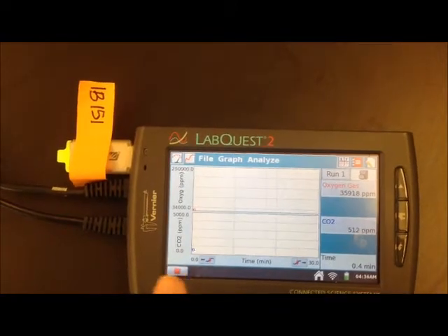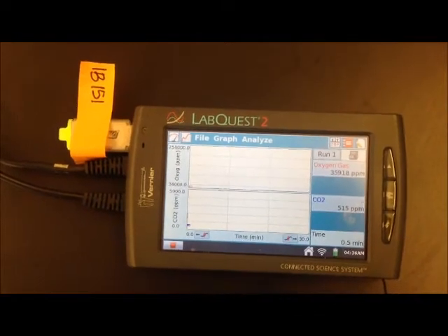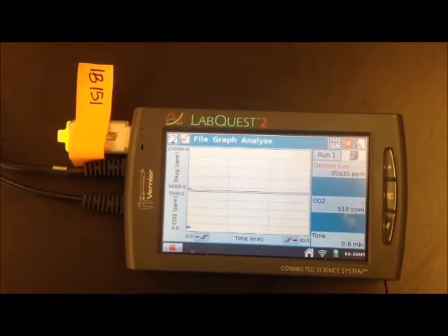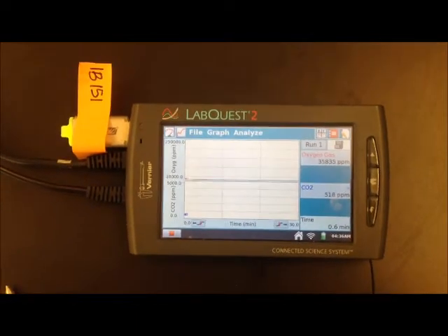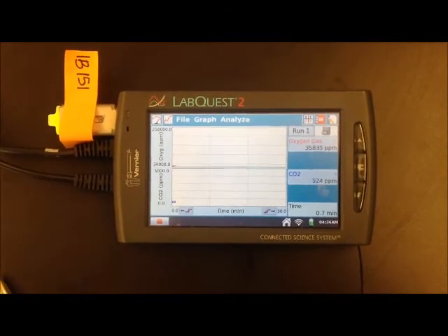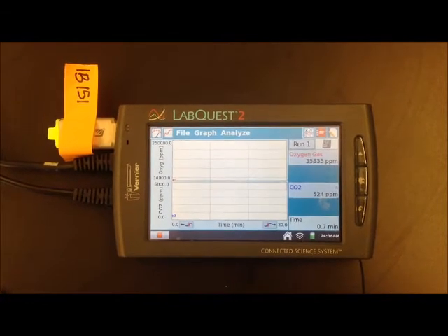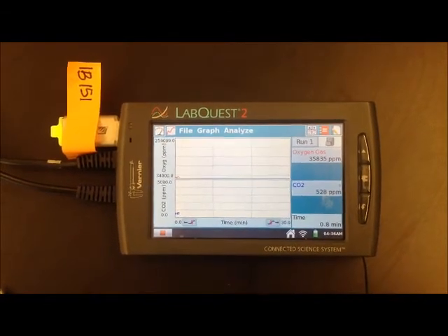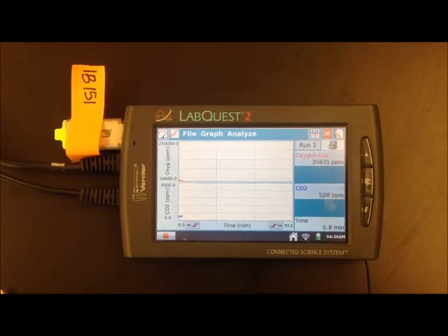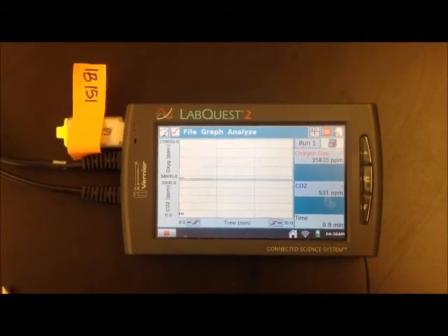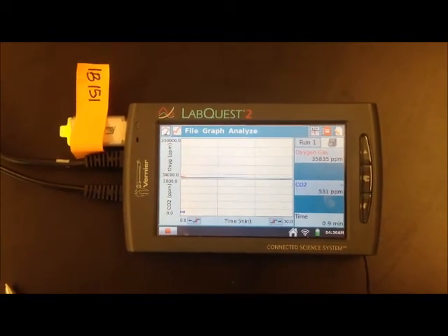As you can see it's been going for 0.4 minutes and it's starting to graph. Once you hit the stop button it will zoom in on the time frame collected. Make sure you read page G6 — that will tell you how to work through this lab. Don't forget to add a second part to number 4. You need to cover the plastic jar with foil before you start collecting data because we want to simulate darkness initially. Feel free to replay if you want to see this again.